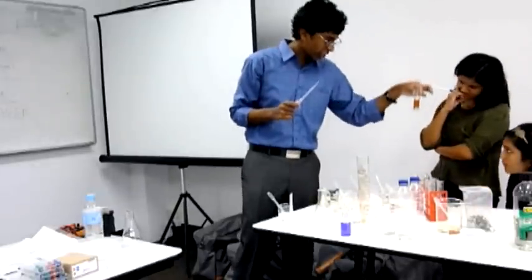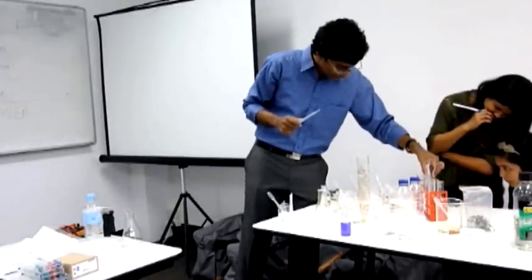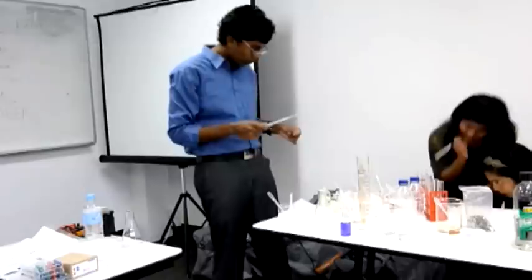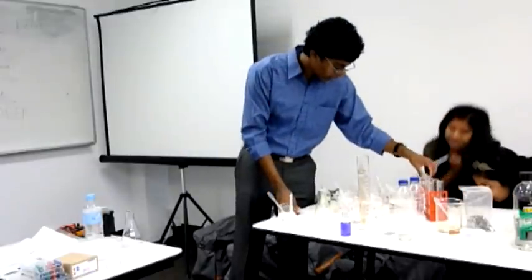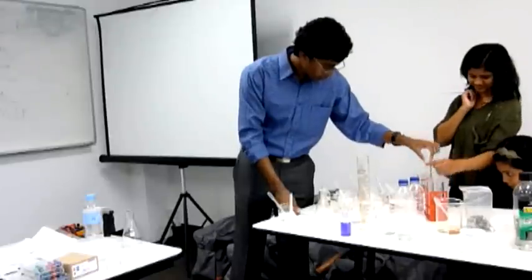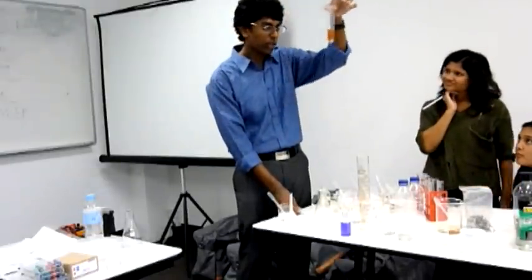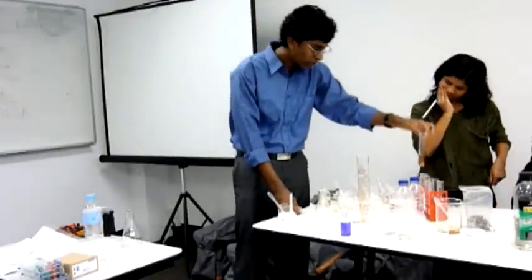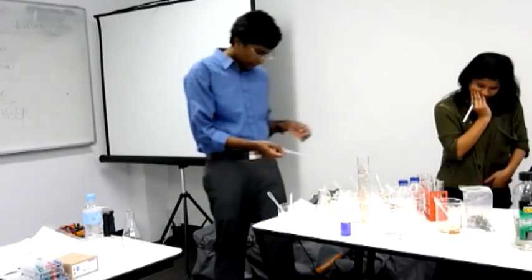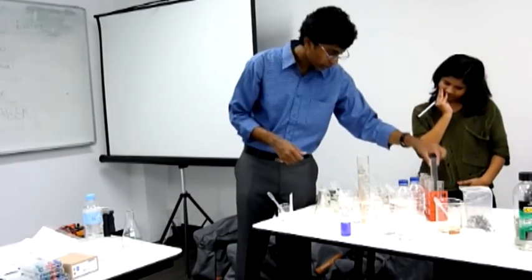So we've already got precipitate in here, so we can't add it to this. What we can do is, this will settle down and it will look really cool after a little while, but what we can do is, did everyone see that by the way? Yes. Just quickly. What color is it more now? Brown. Brown. So what can we assume it might be? Iron 3. Iron 3. Cool, let's test it out.